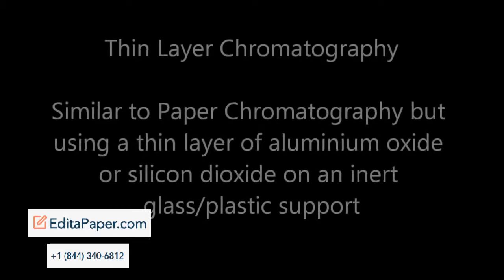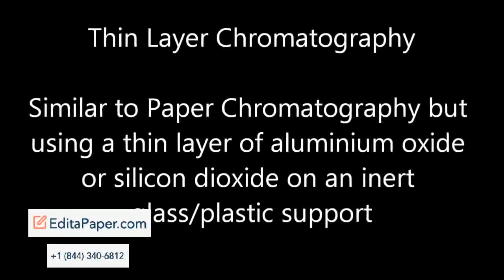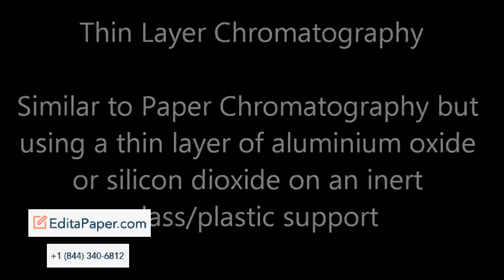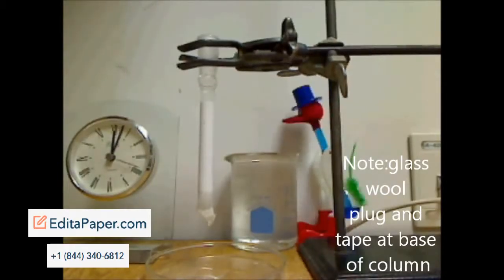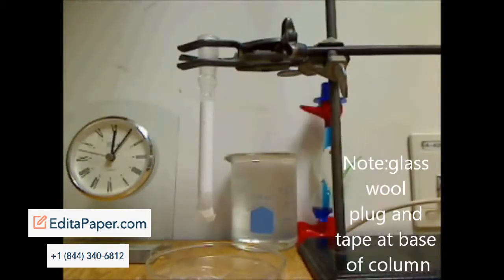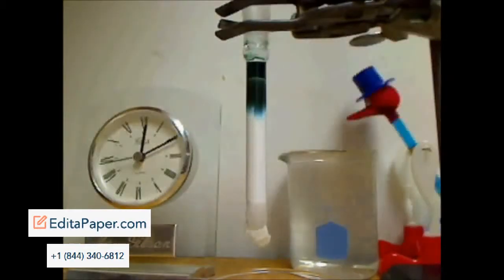Thin layer chromatography, instead of using cellulose as the stationary phase, alumina or silicon dioxide is used on an inert support. Here's my column full of alumina, and I'm running the water mobile phase through first of all. Once that's gone, I've put in my sample of black ink from a black pen.